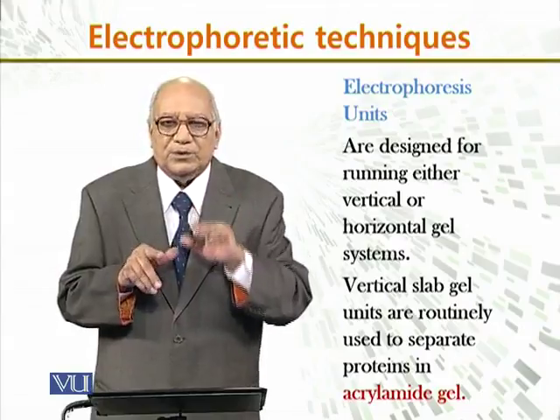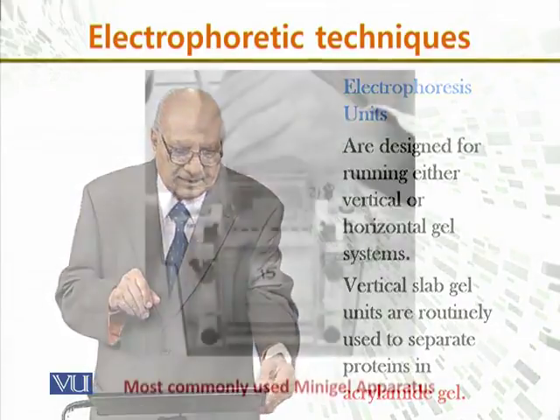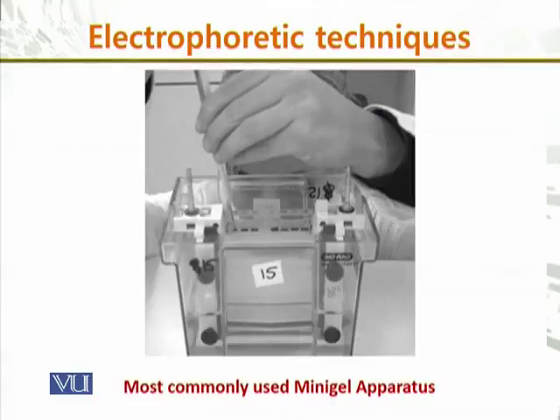In this picture, the most commonly used mini gel apparatus is shown, where you can see the power supply and the gel in a tank which contains the buffer, and then it runs on the gel there.